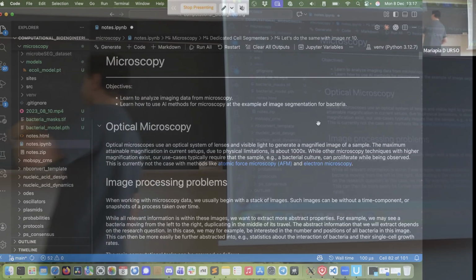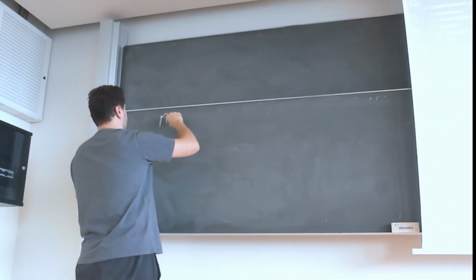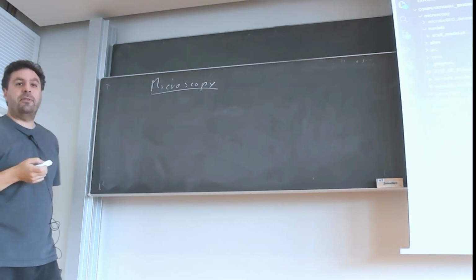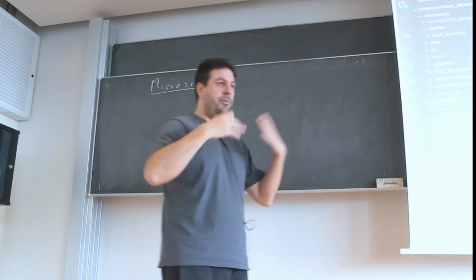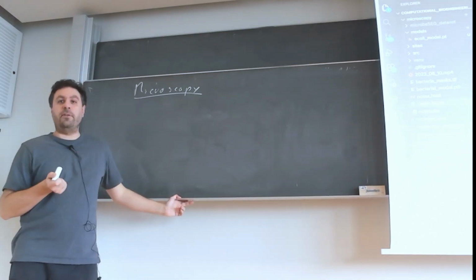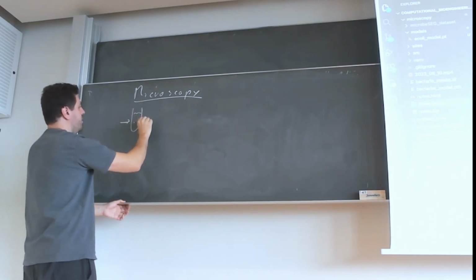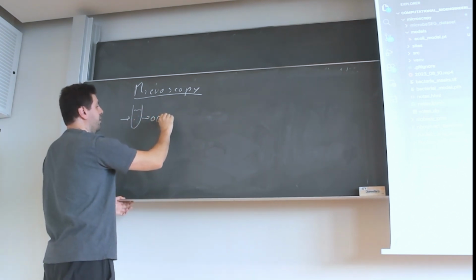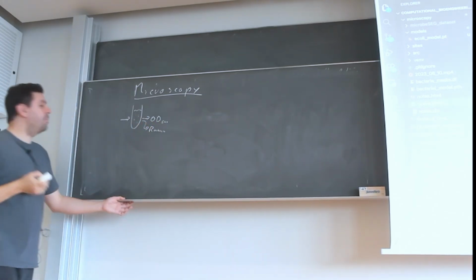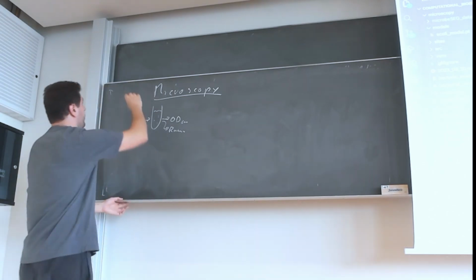So today we are going to learn about microscopy. And of course, we will learn from it from a computational perspective. You might remember the measurement sessions. In the measurement sessions, what we did is you need to observe your experiments, whether they fulfill the hypothesis that you made. And in the measurement section, we looked at bulk measurements, right? So we had some sample with bacteria in it, and we measured some properties like optical density for a certain wavelength and so on, or a Raman spectrum. But these were properties of the complete sample, at the population level.